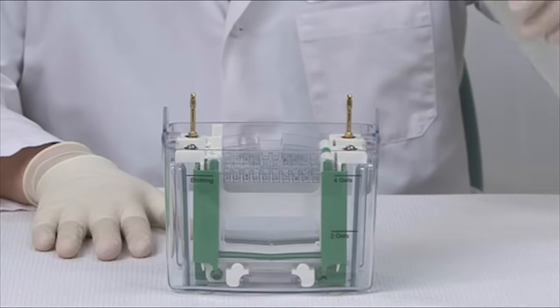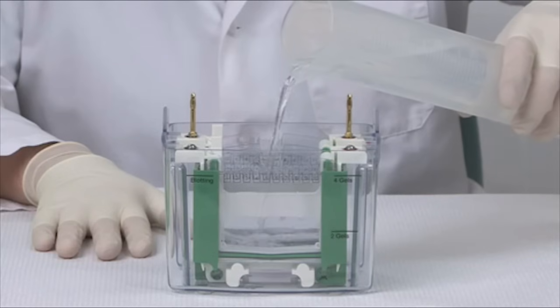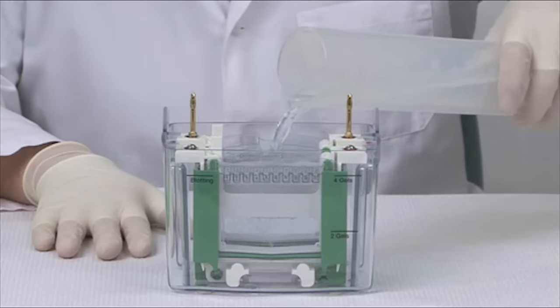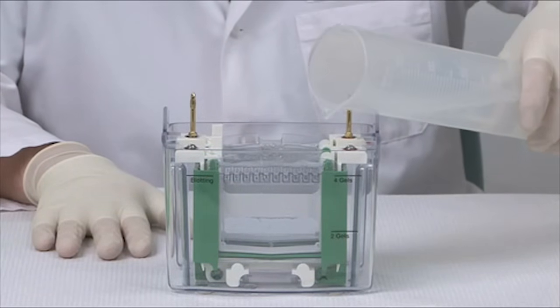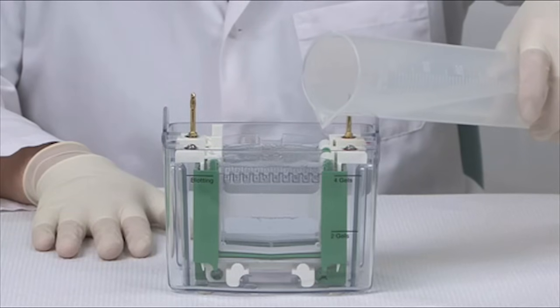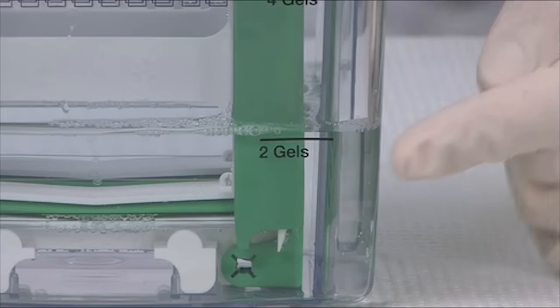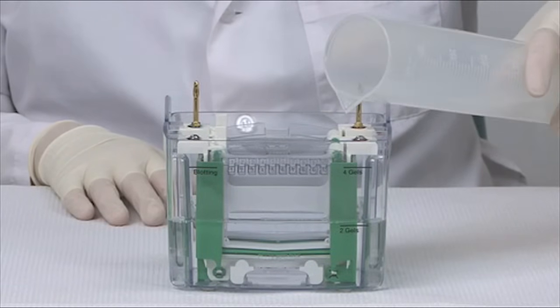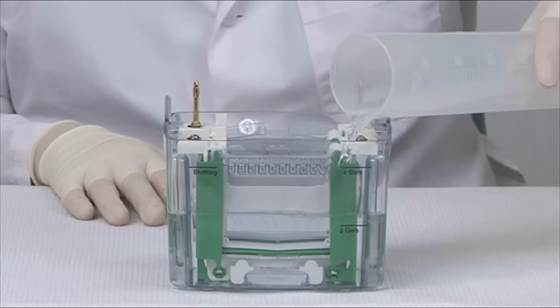Add running buffer by filling the inner chambers first, and then the outside chamber to cover the wells in the gels. If you are running one or two gels in one core, fill it to the two gel mark. Now since I am running four gels, I want to pour buffer up to the four gel mark on the TetraCell tank.